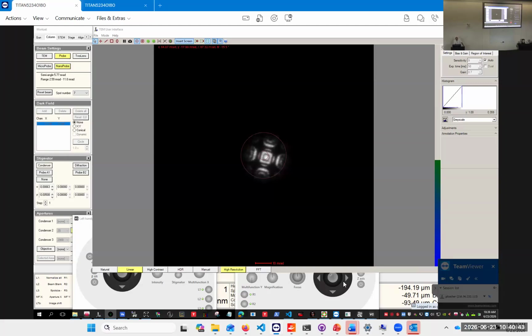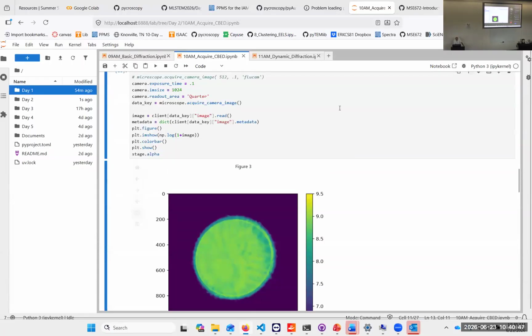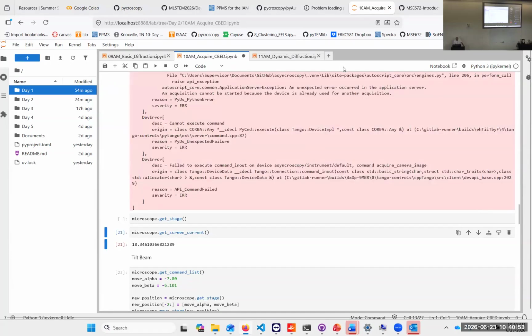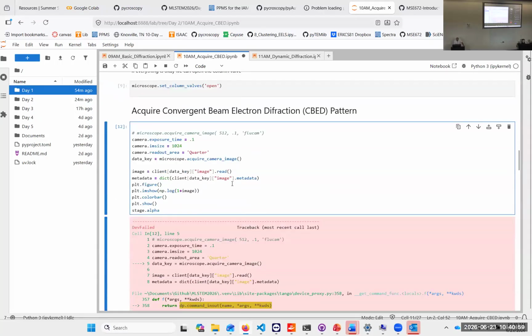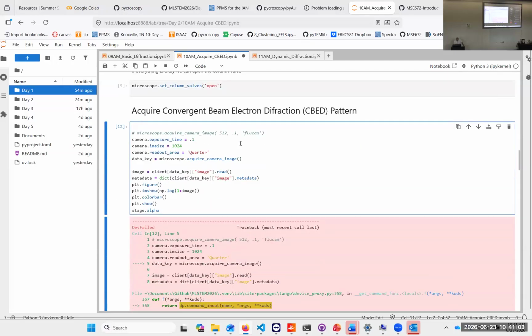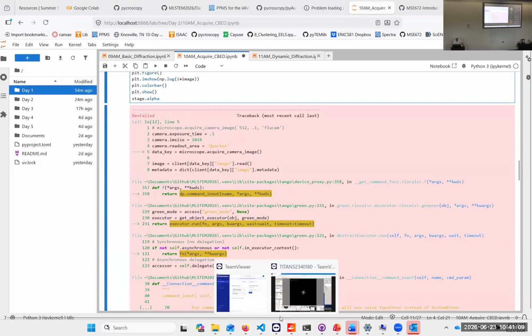And we just can go back and acquire that. Didn't we acquire that already? No. Not messing with it right now.